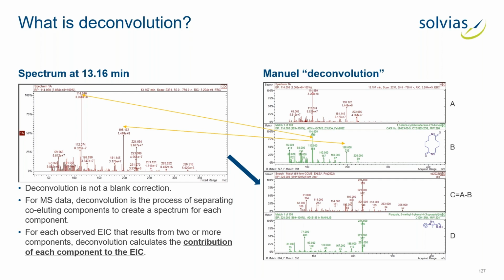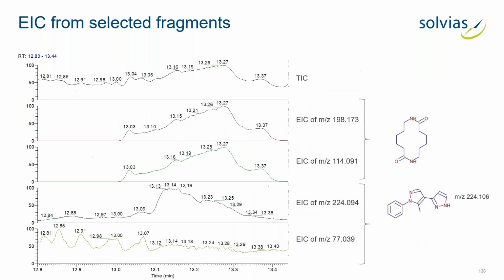And what we did then, we wanted to compare it to see if it's really true. We take, for example, 2 intense signals of the spectra that we know belong to the compound that we identified. And it's the same with the second compound. And then we make some extracted ion chromatograms to see really what the chromatographic dispersion is for both of them. And here you have, for example, all the extracted ion chromatograms, and you see some of them. This fourth one in the line belongs, for example, to another compound than the other 2 on top. And the last one seems completely different.